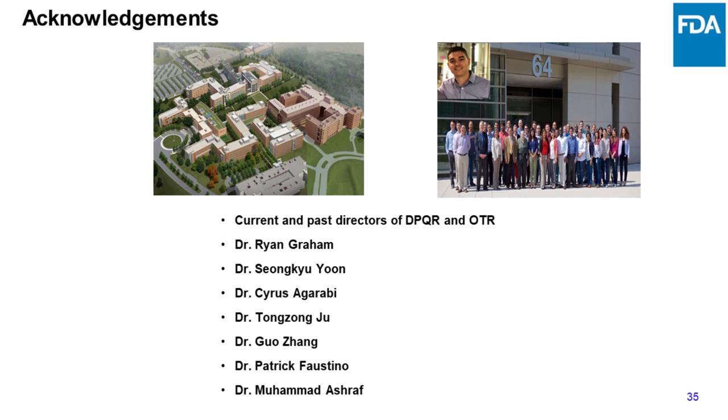Okay, and Madhav, besides cell culture medium and the feed supplements, did you consider any other source that may add to the variation in metal concentration and affect product quality?